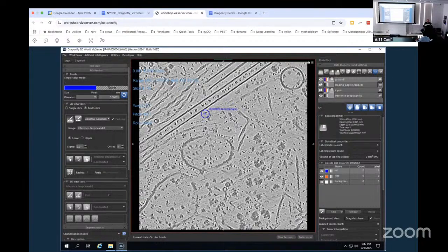If you hold Control and you click with that brush, it will just add things. It crashed? Oh no. All right. Is that working for most people? How can we unselect? Holding Shift and clicking on it will deselect it. It crashed again. Oh my gosh, I'm so sorry. That's okay. I don't know why mine did too, but then it started working.